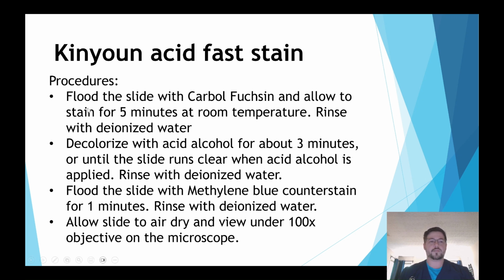So here's a list of the procedures for the Kinyoun acid-fast stain. I'll go through them quickly, and then I have a video that I can show you guys. So you're going to flood the slide with the carbolfuchsin and allow it to stand for 5 minutes at room temperature, and then rinse that with deionized water. You'll then decolorize with acid alcohol for about 3 minutes.